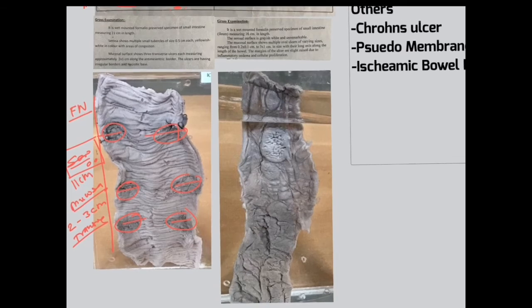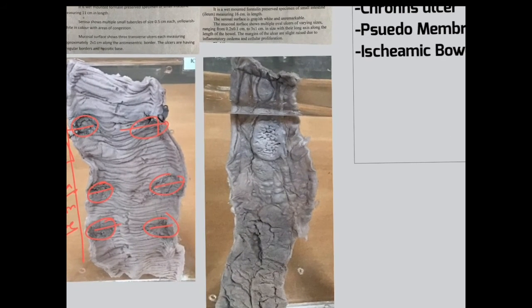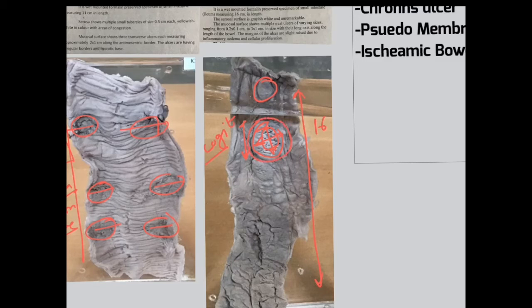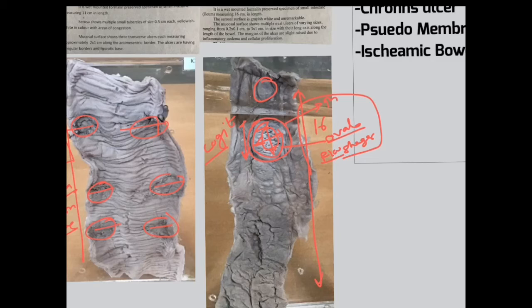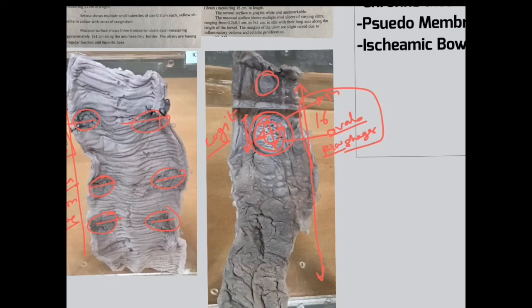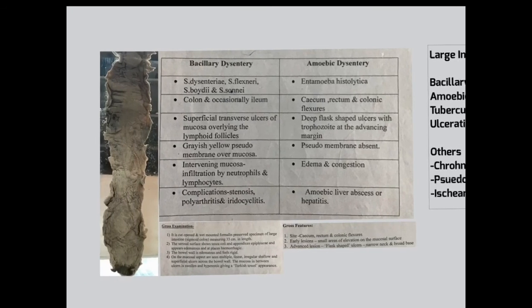Coming to the typhoid ulcer — again a formalin-preserved wet mount specimen of the small intestine, specifically the ileum, measuring around 16 centimeters. It shows two ulcers placed longitudinally, measuring around 2 by 3 centimeters. The central area shows necrosis, the border shows hyperemia and thickening, the ulcer is oval in shape, and the floor shows shagginess. These are the features of the typhoid ulcer, which is placed longitudinally on the mucosal surface. On the serosal surface from the outer side, there are no nodules — that is how you differentiate between these two.